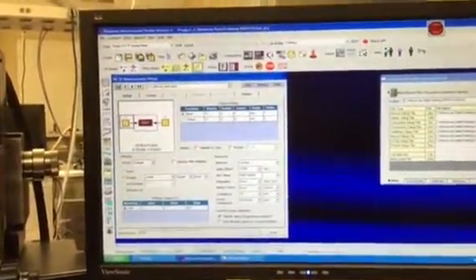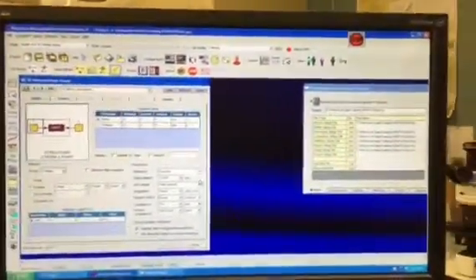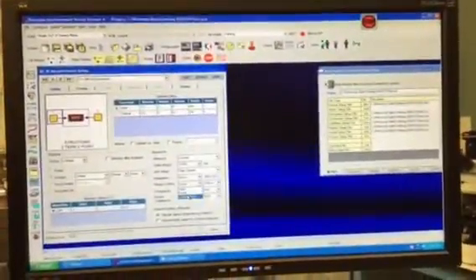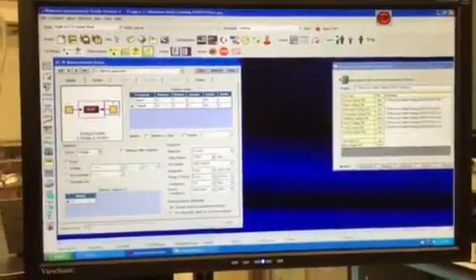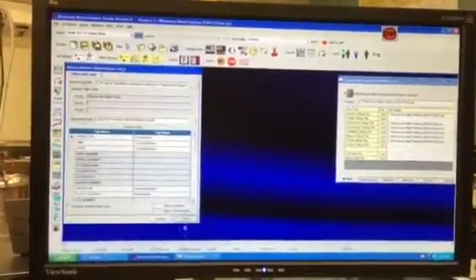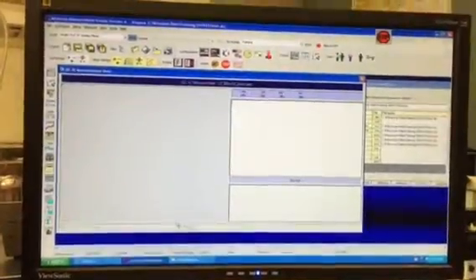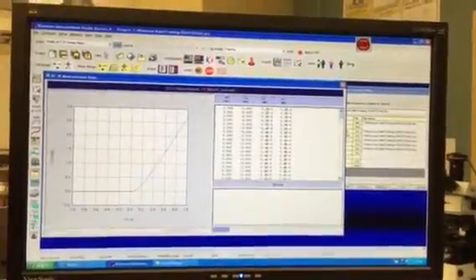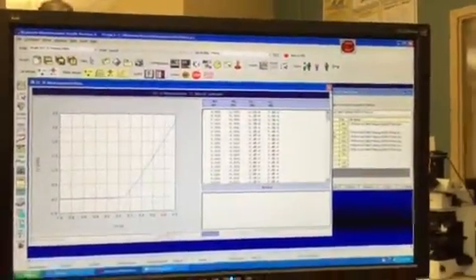And like I said, I'm sort of explaining it simply. There are some good application notes that really get into it, but I'm going to go back to limited auto. And I think there's a description of that within the WaveView manuals as well. Alright, so we're back to where we have a measurement.